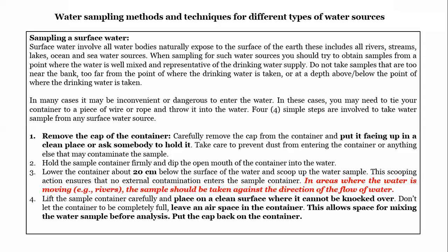where we cannot get any contamination. Or you can give it to some other person to hold. Maybe you have an assistant on the field. You can give that person to hold it. And you should make sure your fingers do not enter inside the lid while you're removing it. So this is how you have to do it for the first step.